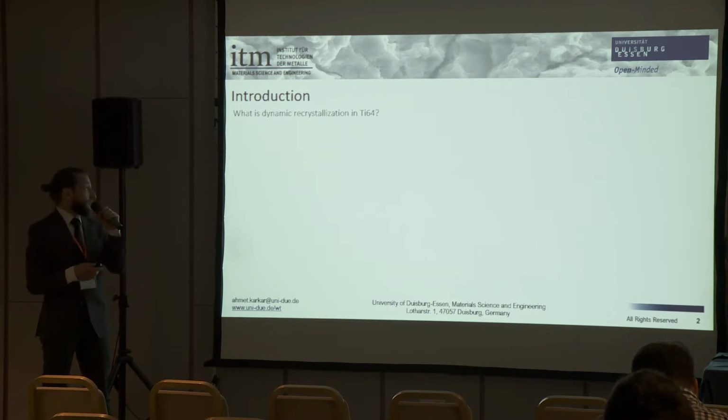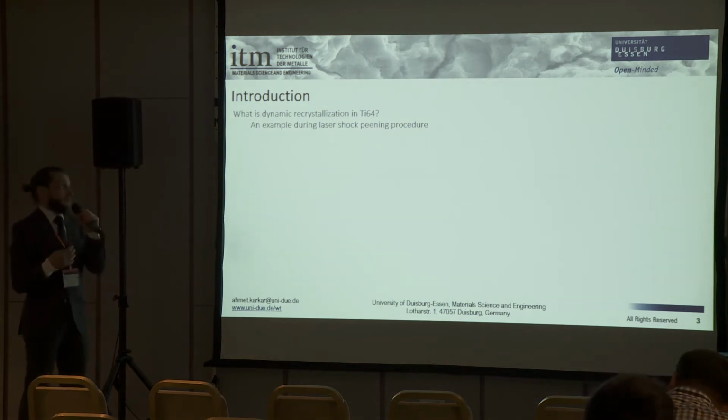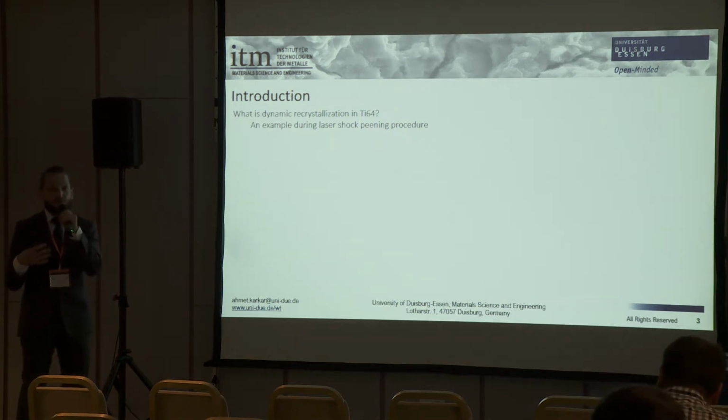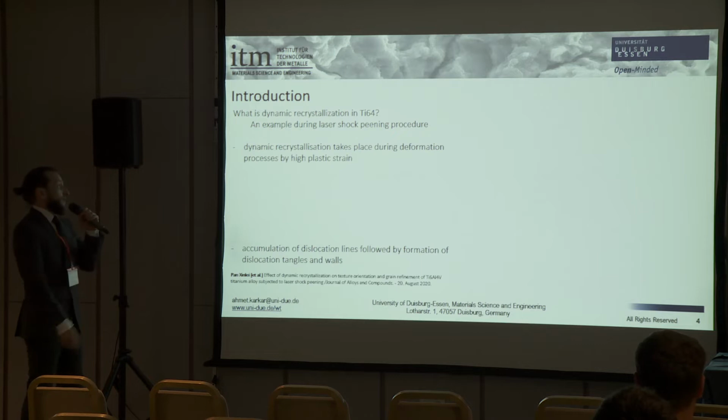To get a better understanding of what dynamic recrystallization is, I will first show you some results from the literature of the microstructure of titanium 6-4 after dynamic recrystallization and grain refinement.